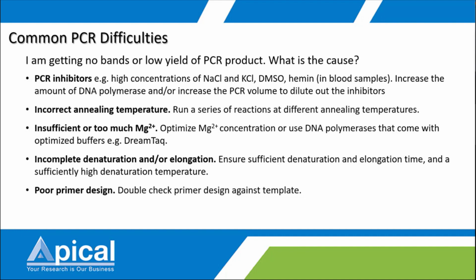One more important thing, do check your primer design and make sure there is a priming site in your template. For some of us the gene may be unknown, or de novo, so maybe you want to use nested PCR to help you get your gene of interest.